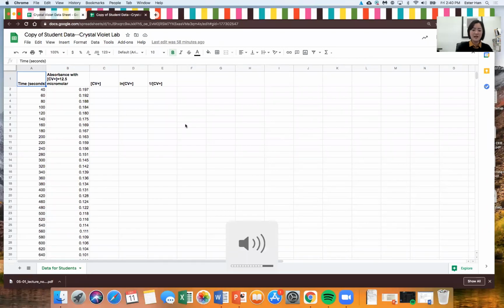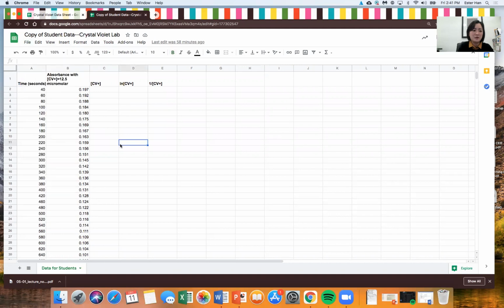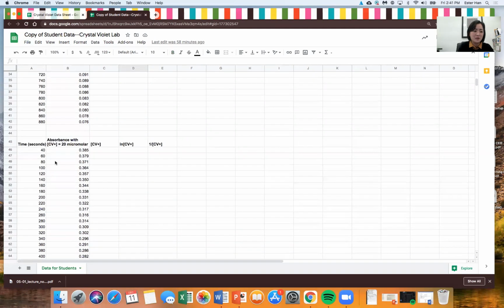All right, guys. So today I'm going to spend a little bit of time going over our lab data that you should be able to pull up on Schoology. All of you should see something where it says student data crystal violet lab, and you should be able to pull up this Google Sheet. Make sure you go to file and then make a copy for yourself and don't write on the actual document itself. That way you won't be messing up the original spreadsheet.